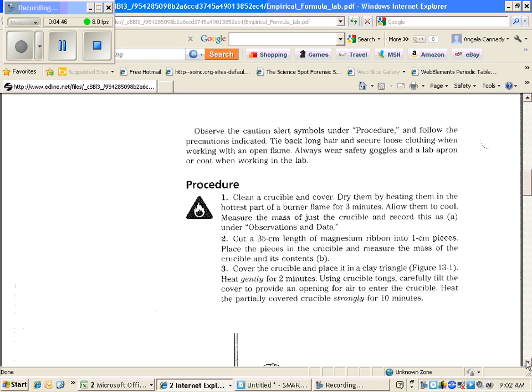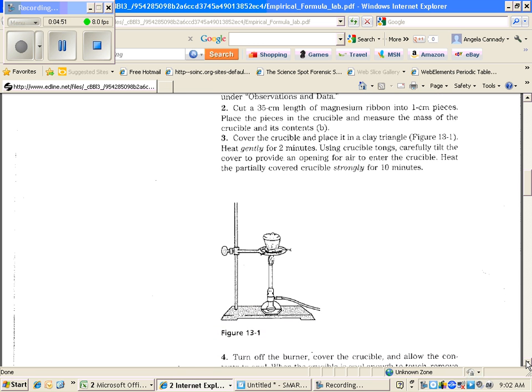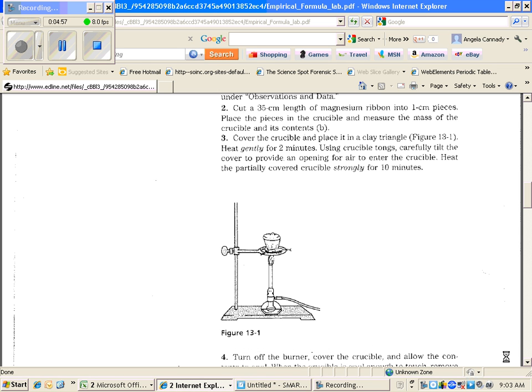You're going to do that. When I mean strongly, I mean strongly. When you're going to have that burner, you're going to see how the flame is touching the bottom of the crucible. It's not on a wire gauze. It's on a clay triangle. That flame is going to be wrapped around that crucible. You want that to get really hot.